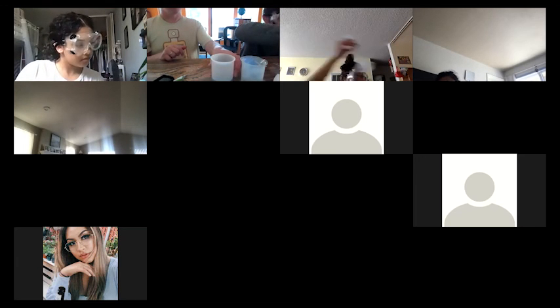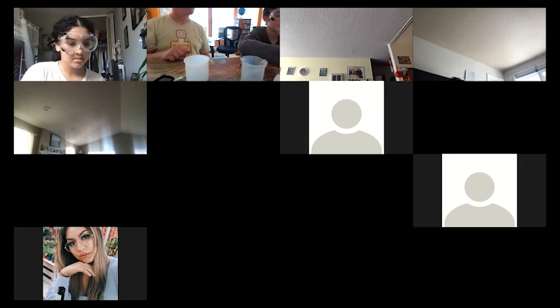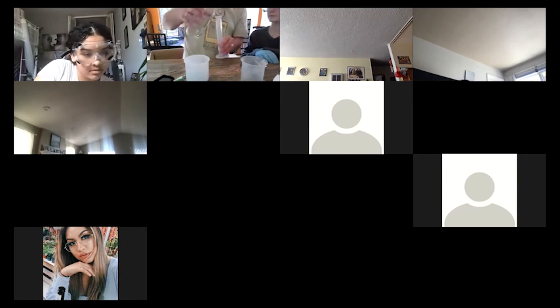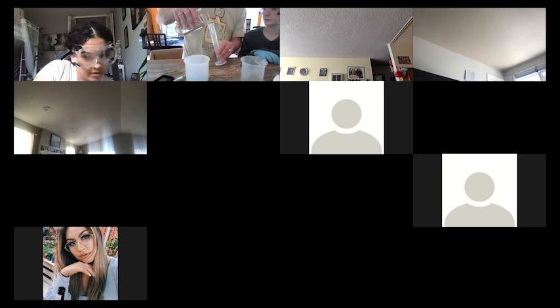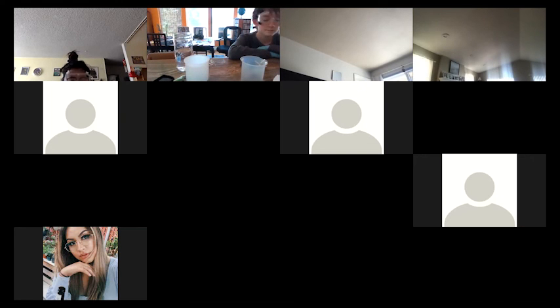And we'll rinse this a couple times. Oh, actually, why don't you just fill that up and I'll dump it because there's still some copper in there. So I'll rinse that out for you. I'll be right back. All right, there you go.